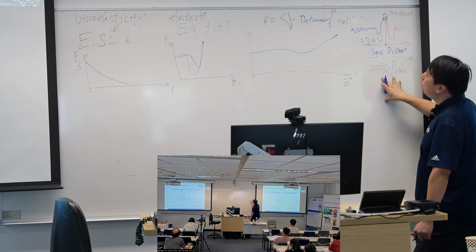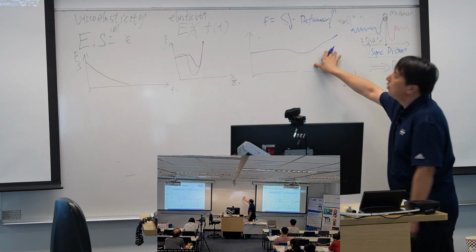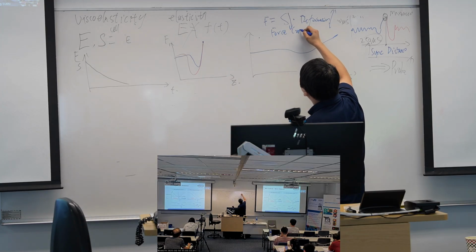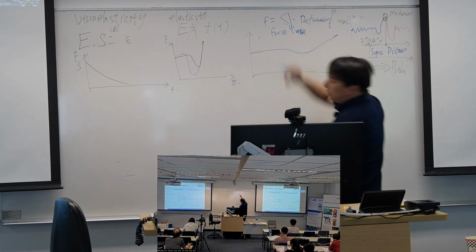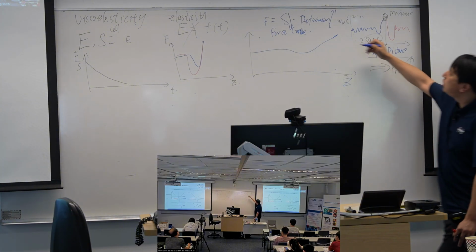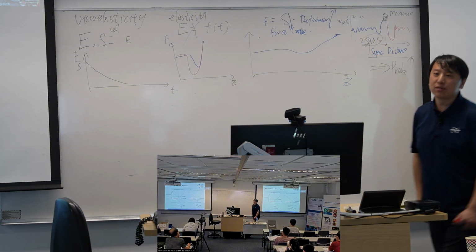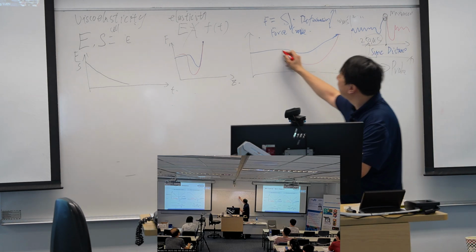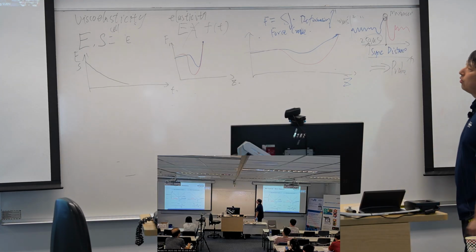So for the force curve, the logic is quite simple. We only need to reach a maximum force, and then we can get back. That's the force curve logic.